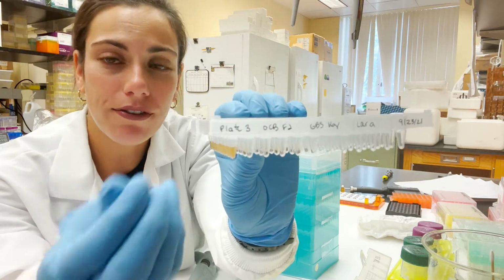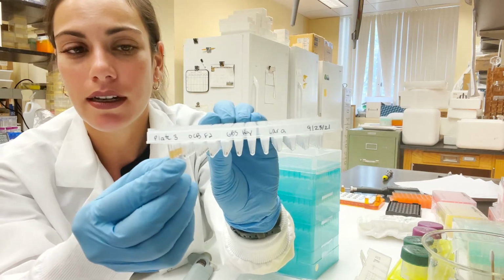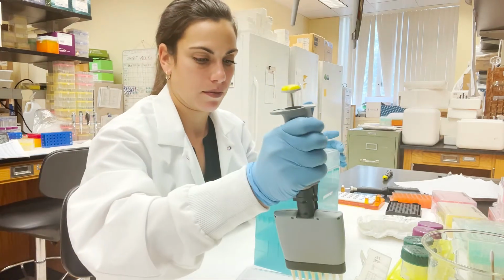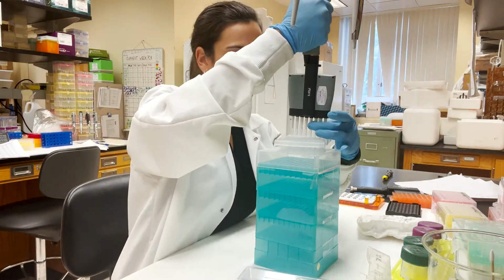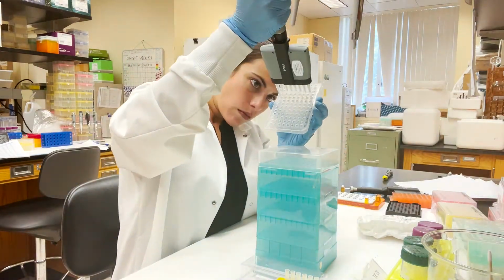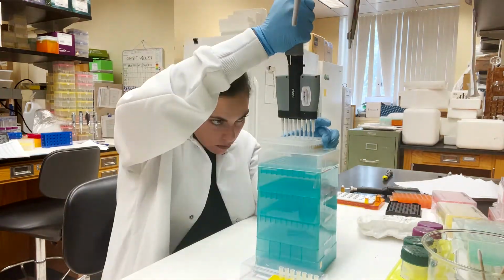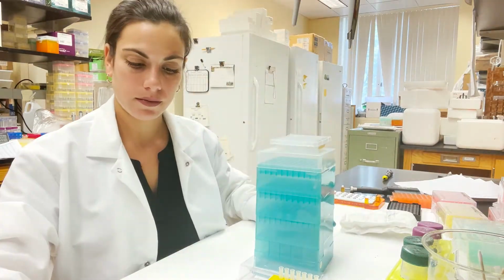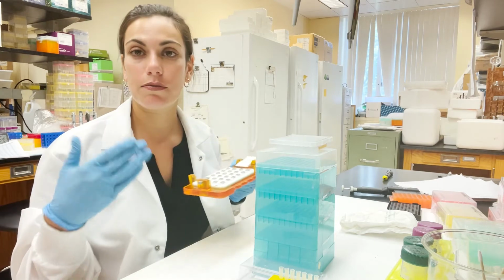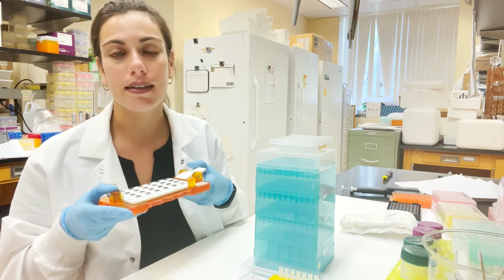Sometimes the tips fall off of the pipette because you kind of got to rub it around the well to be able to get them to go back into solution. You just push them back up. That takes a while sometimes. But then what we do is we put it back on the magnetic strip now that we've mixed the DNA back into solution. We want to still remove the beads and get just our clean DNA.